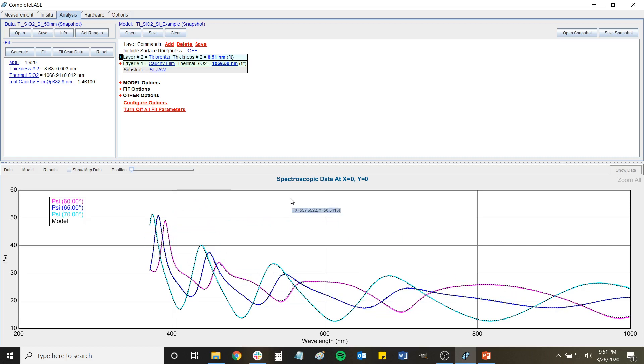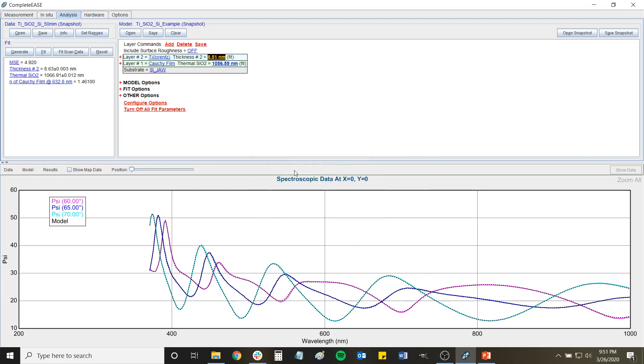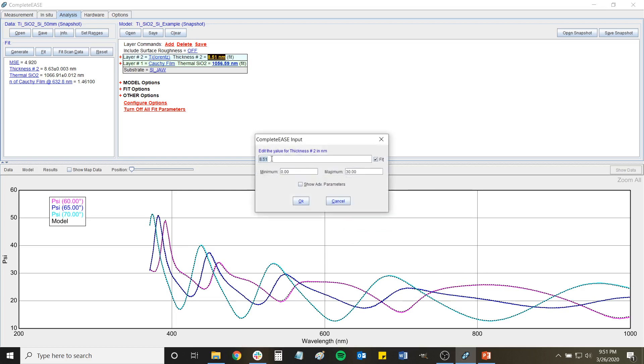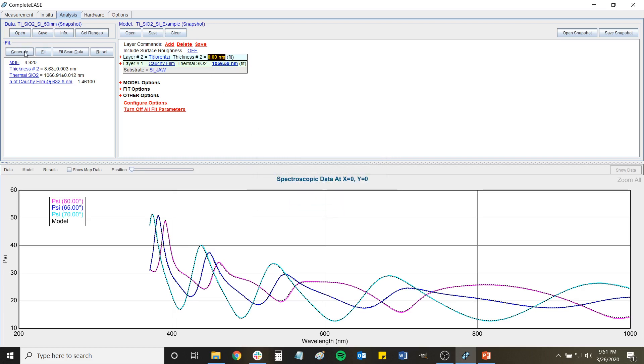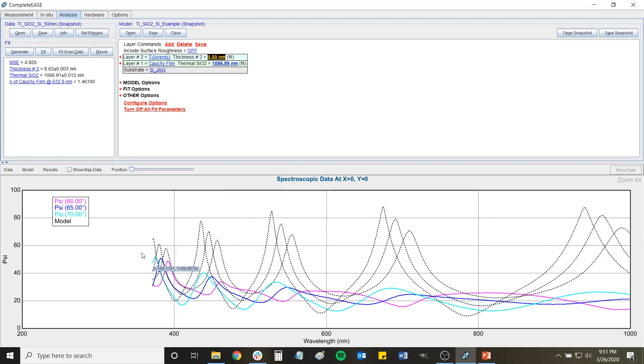So what I'll do is I'll just say, let's just take this thickness and set the minimum to zero. Let's just set this thickness down to zero, and now that thickness is zero, let's just hit generate and see what it would look like. So if there's no titanium at all and it's just an oxide film, then you would basically have these typical transparent looking interference patterns.